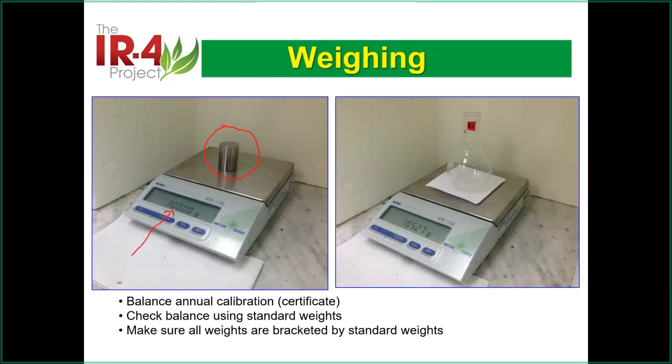In my lab, in my experience, I never saw anything different. But I worked all over the world. Sometimes this is 1, sometimes this is 2, a little bit of change in 1 or 2 digits, which is acceptable, depending on your SOP, because the temperature may not be controlled well, or maybe the humidity, or maybe the instrument has been used too much.